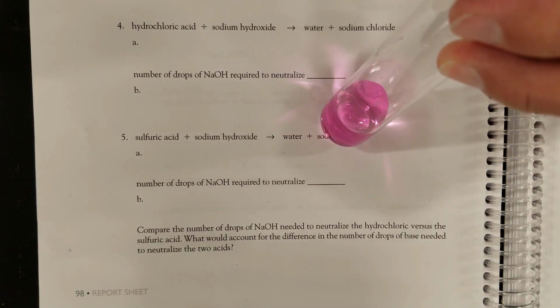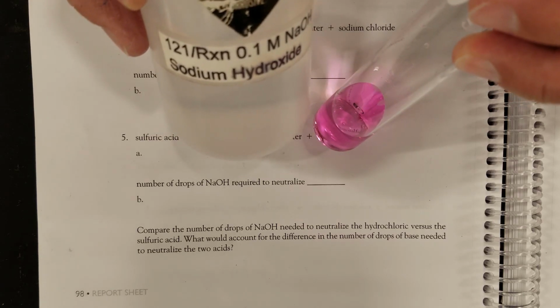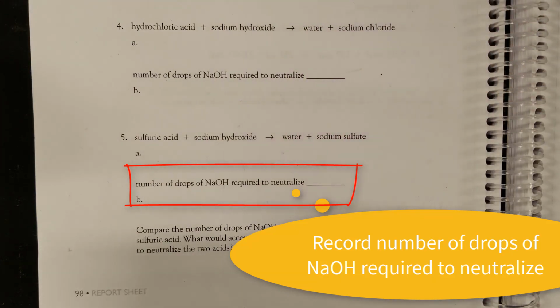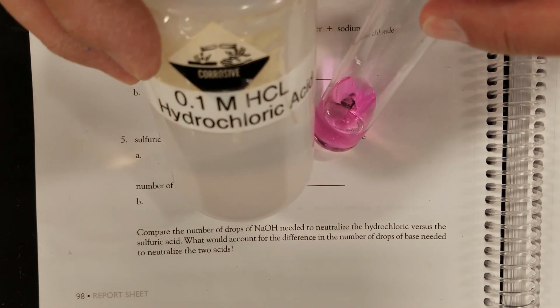So it took 10 drops to neutralize the sulfuric acid. It only took 5 drops to neutralize the hydrochloric acid.